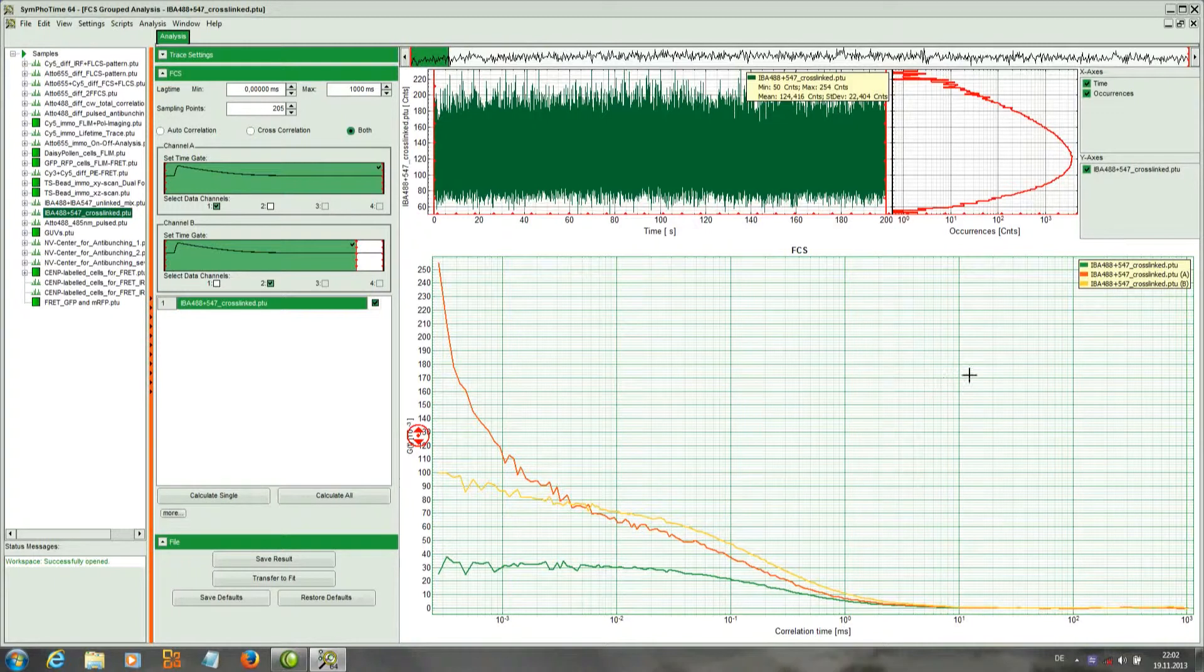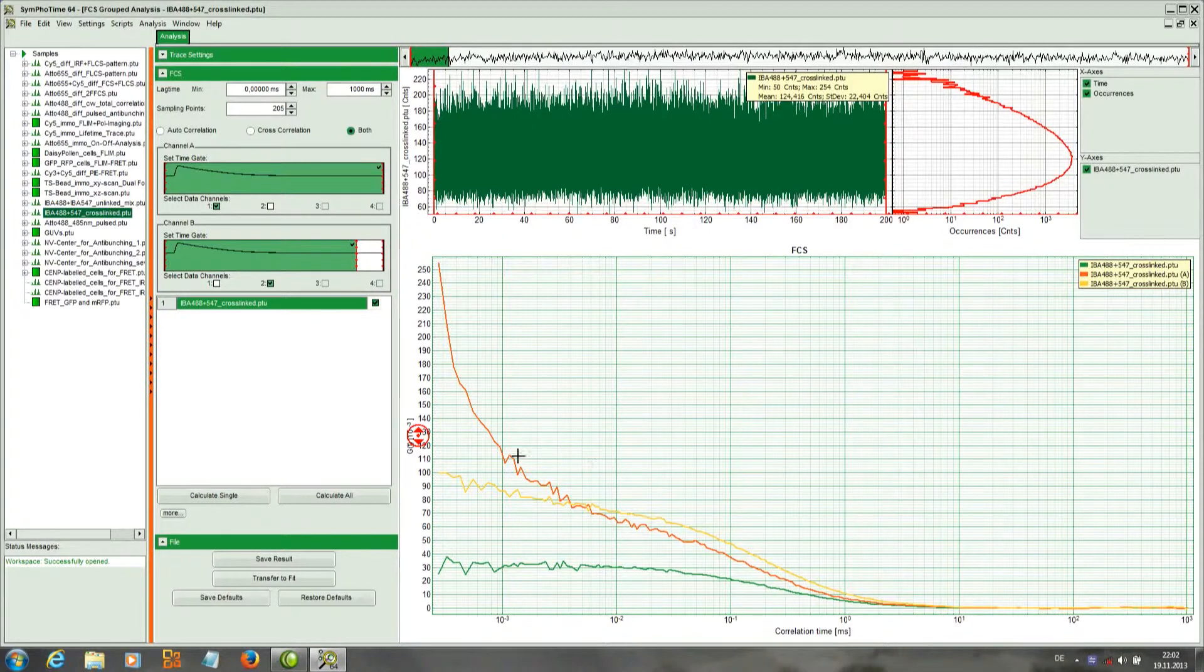The yellow and the red curves are the autocorrelations. Here you can see which curve is basically which.